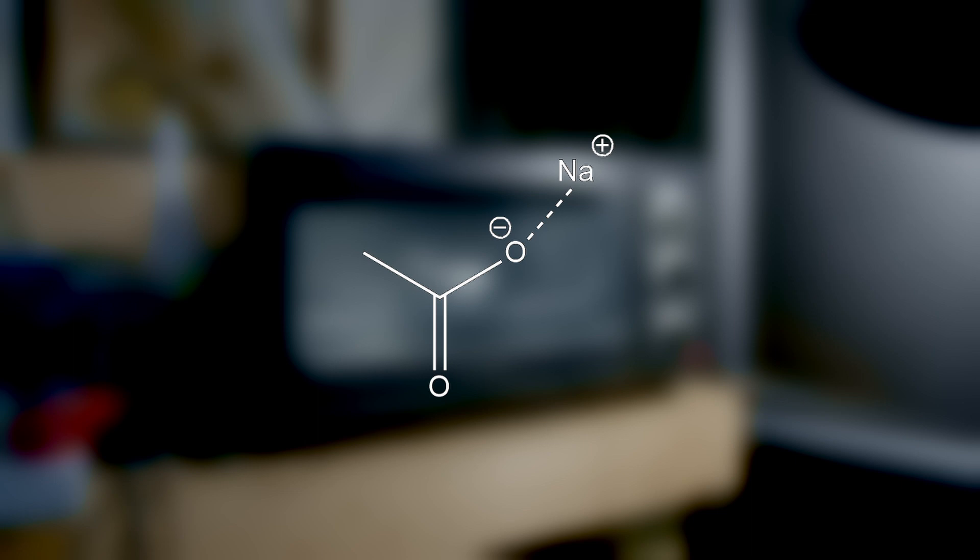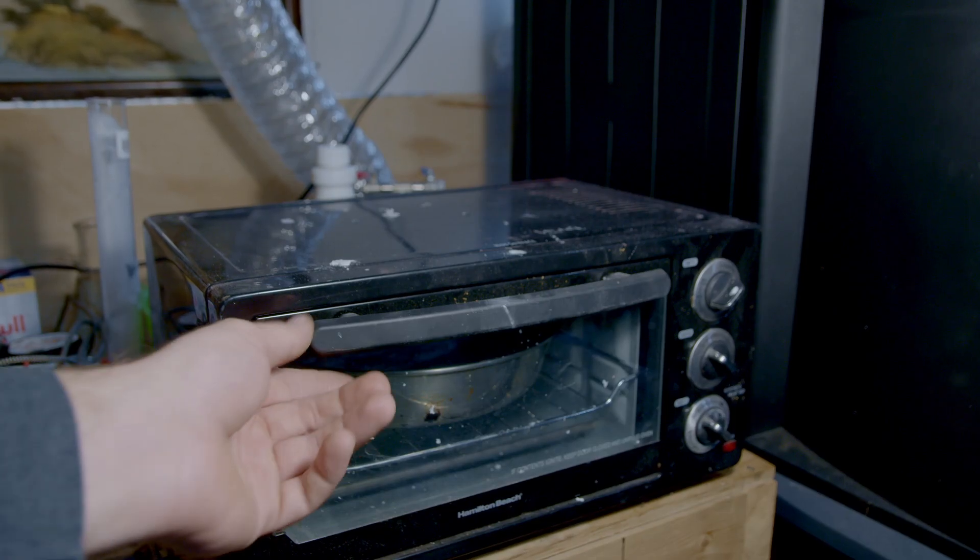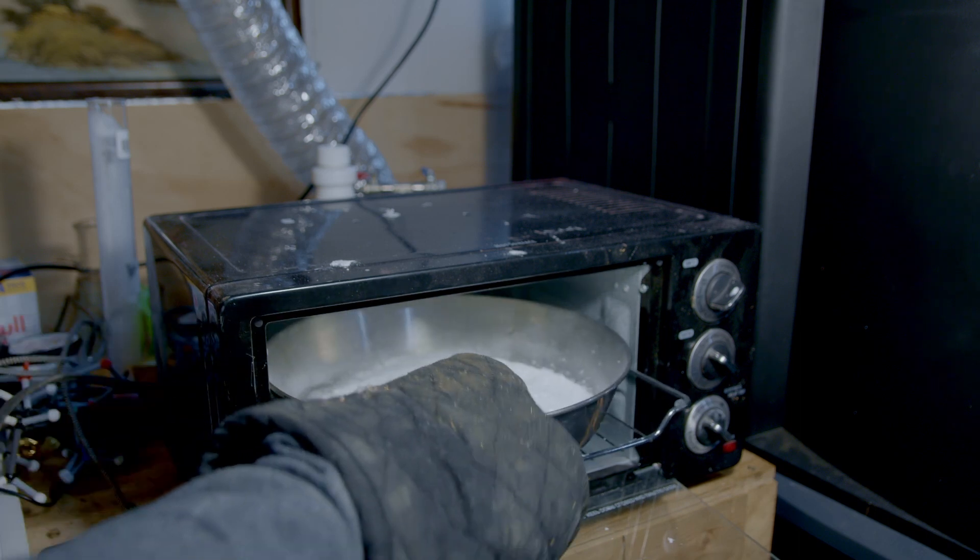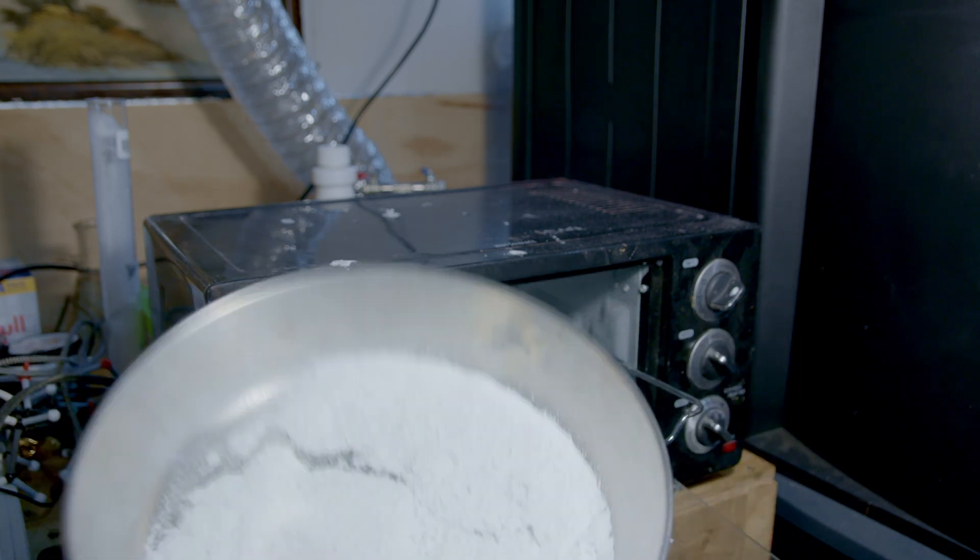It's important we do this to get all the water off or we're going to have water in our acetic acid at the end. I transferred it to a bigger dish and I ground it up a little bit, but you want it to be a nice fine powder like this.